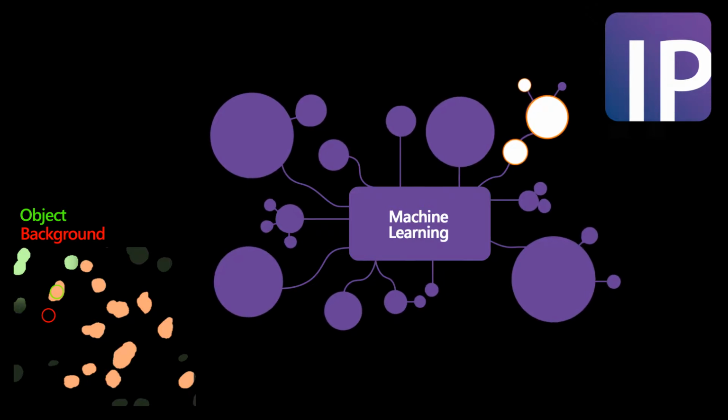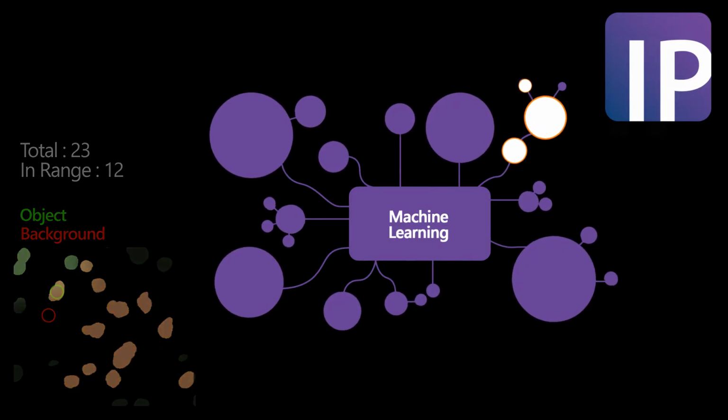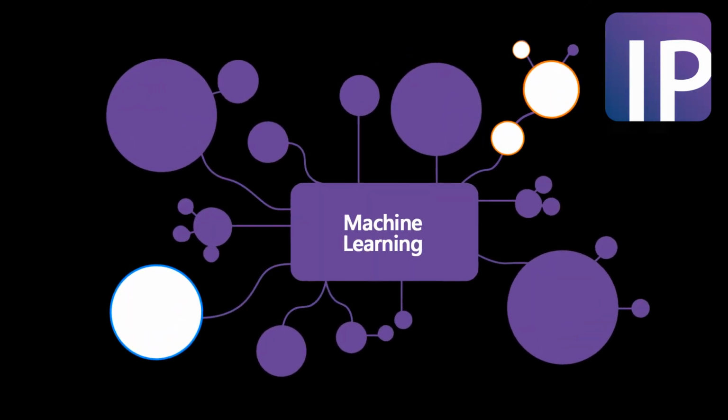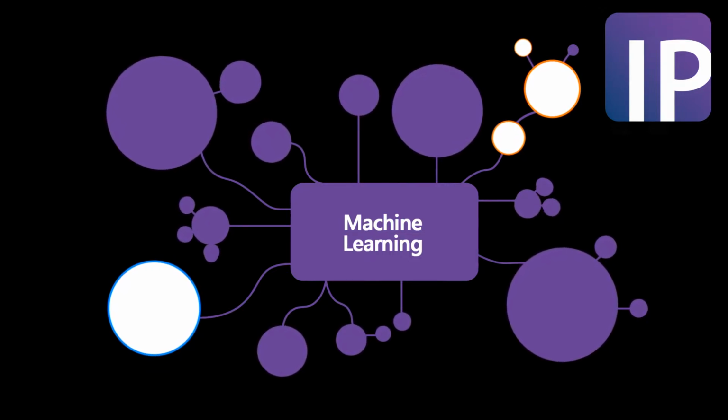While training across additional images, Image Pro maintains a running total of all objects, so it is clear how the changes will impact the final results. The highly flexible nature of smart segmentation allows for adjustment between images in a set. As some structures may not be ubiquitous throughout the sample, one image may not be representative of the whole experiment. Smart segmentation may be updated or adjusted with new inputs that are refined from additional images to correctly analyze the entire set. Image Pro uses machine learning to continuously refine the selections by the customer, optimizing the smart segmentation stage.